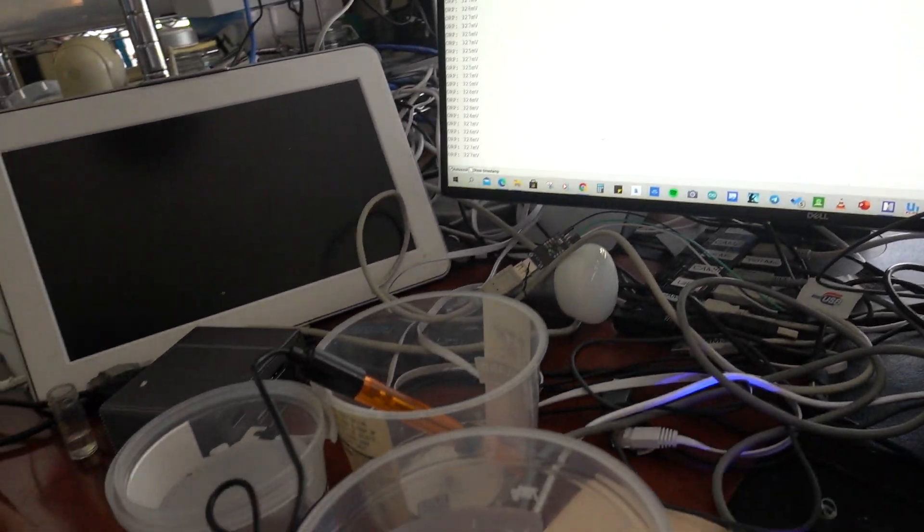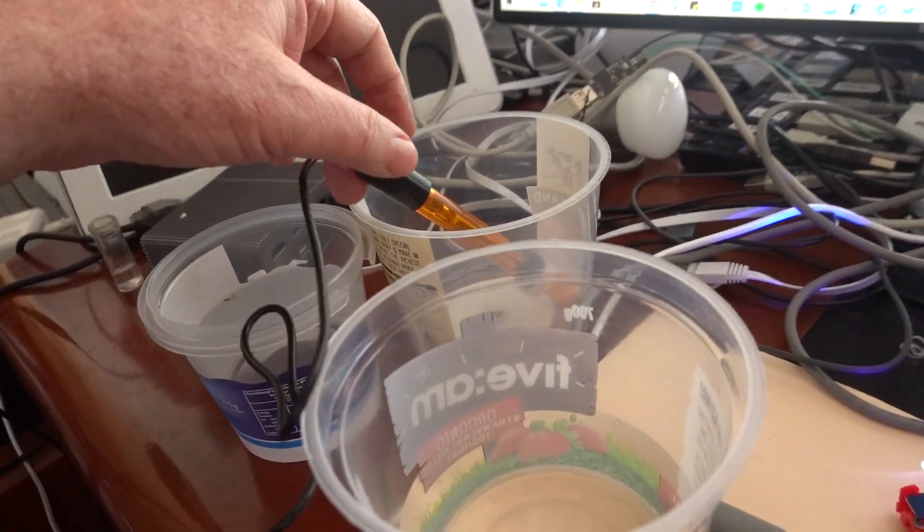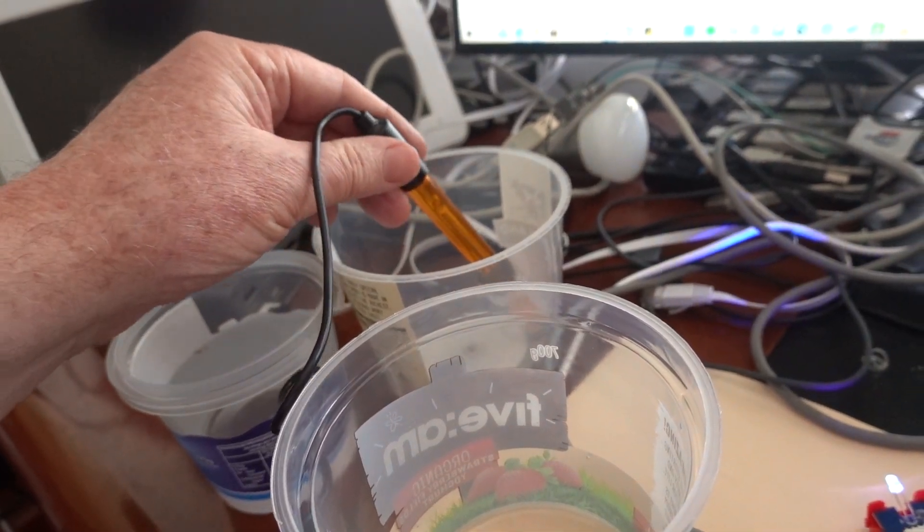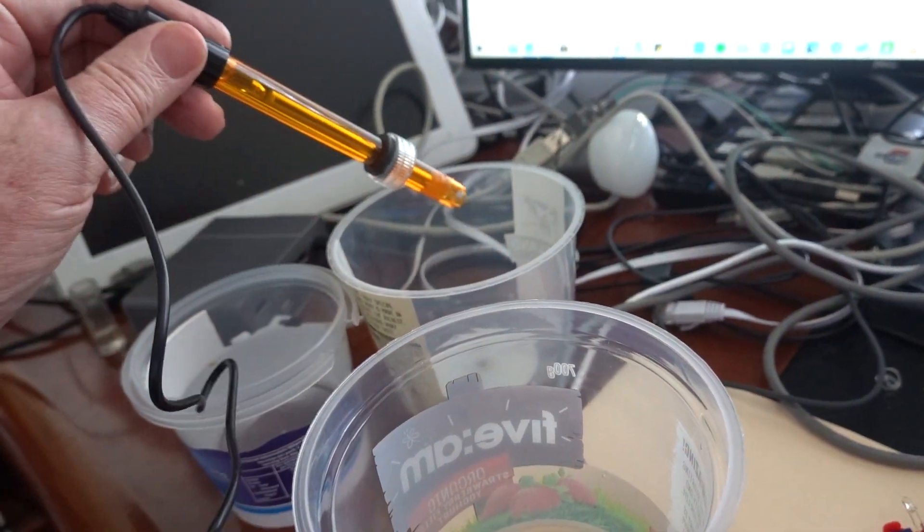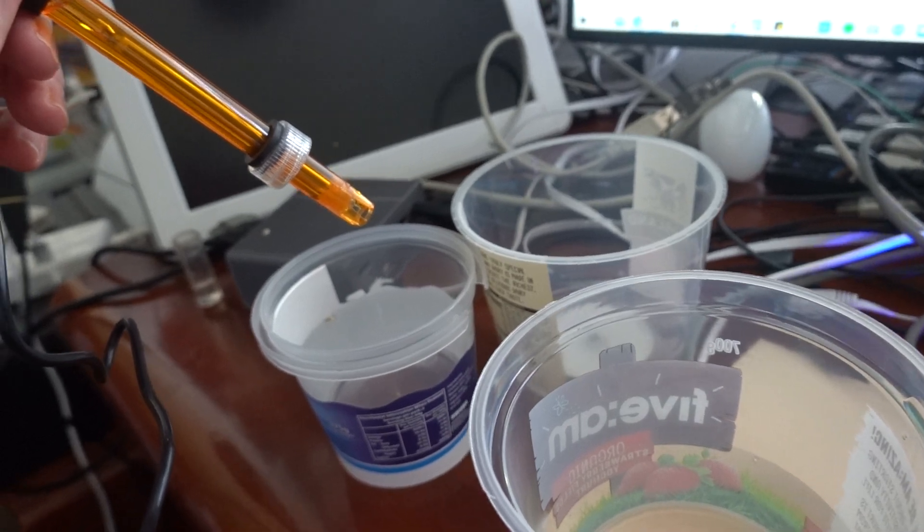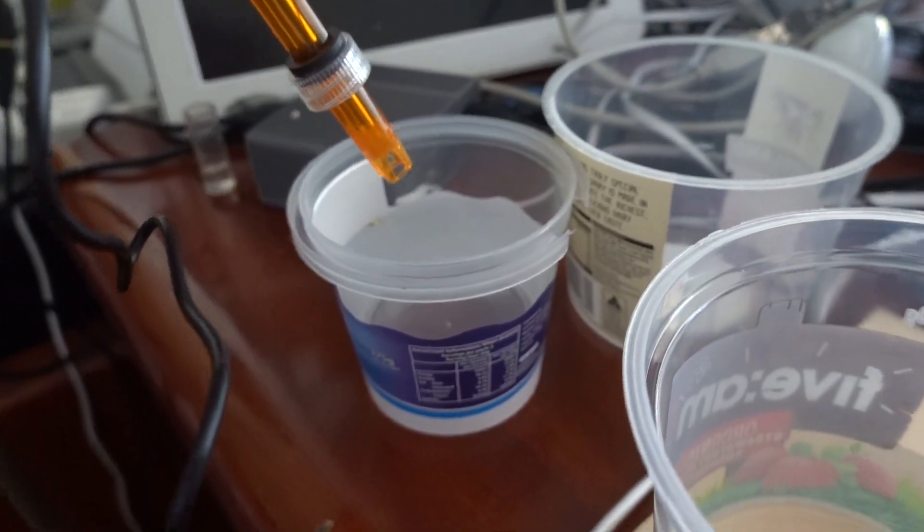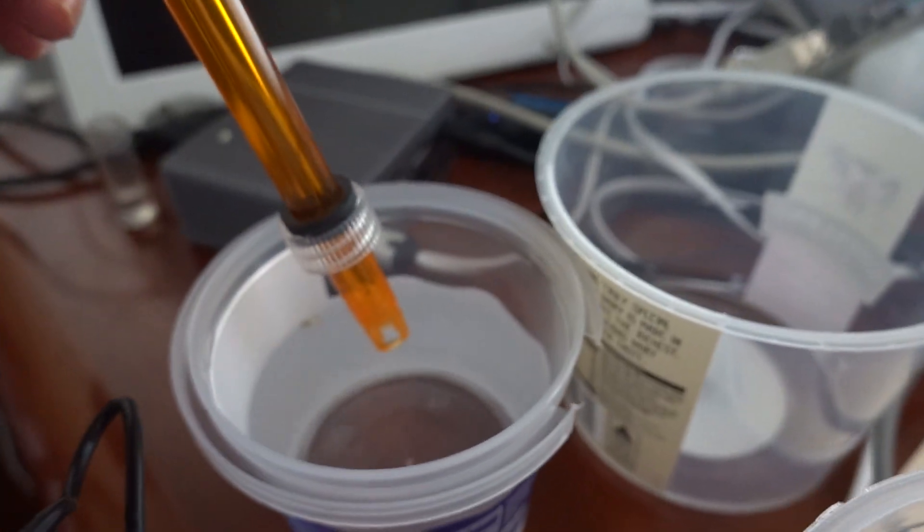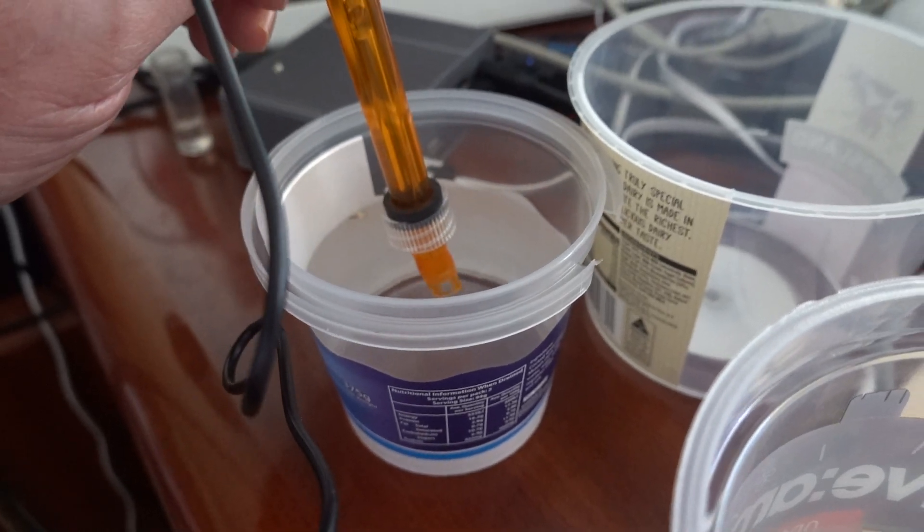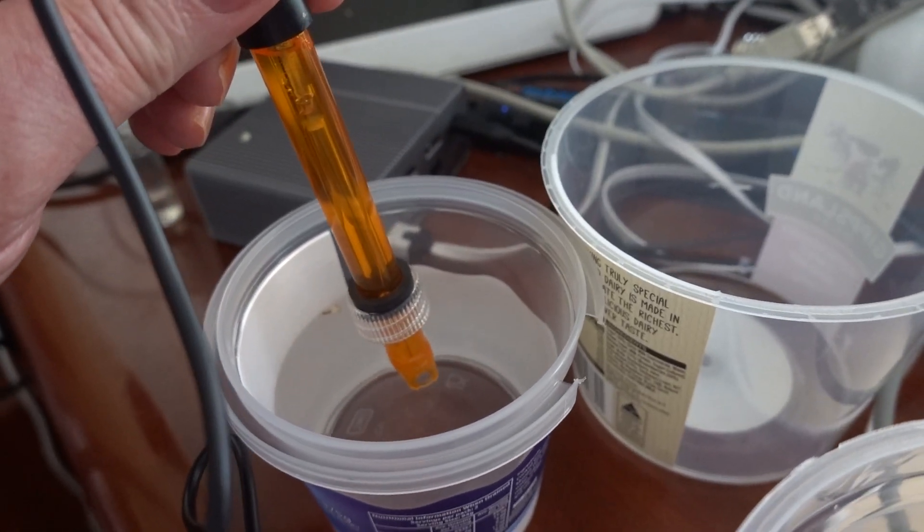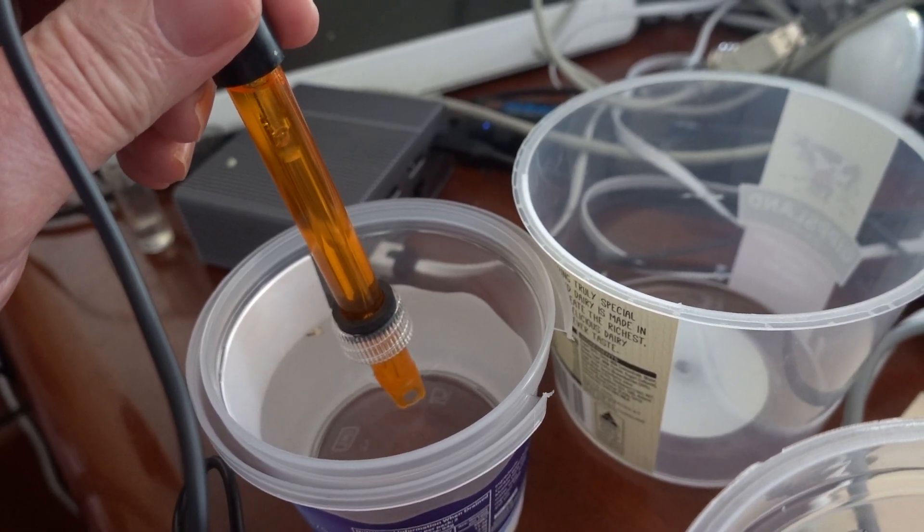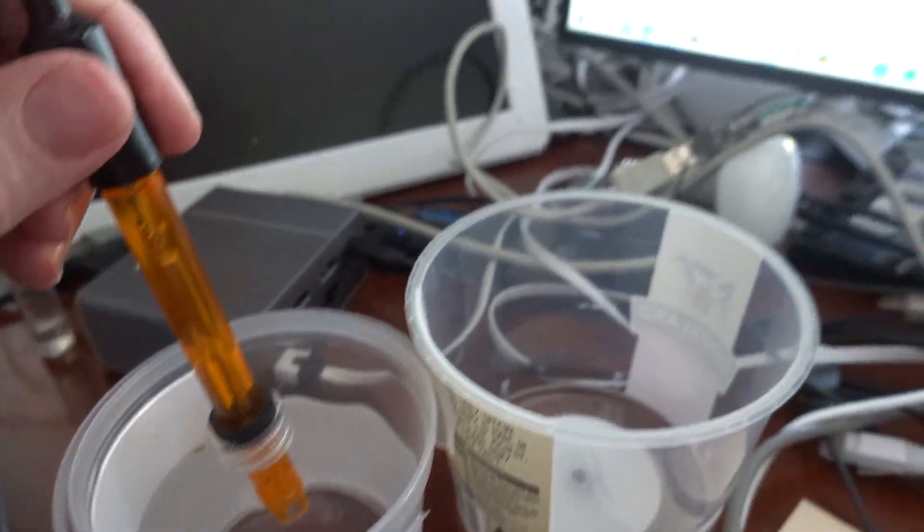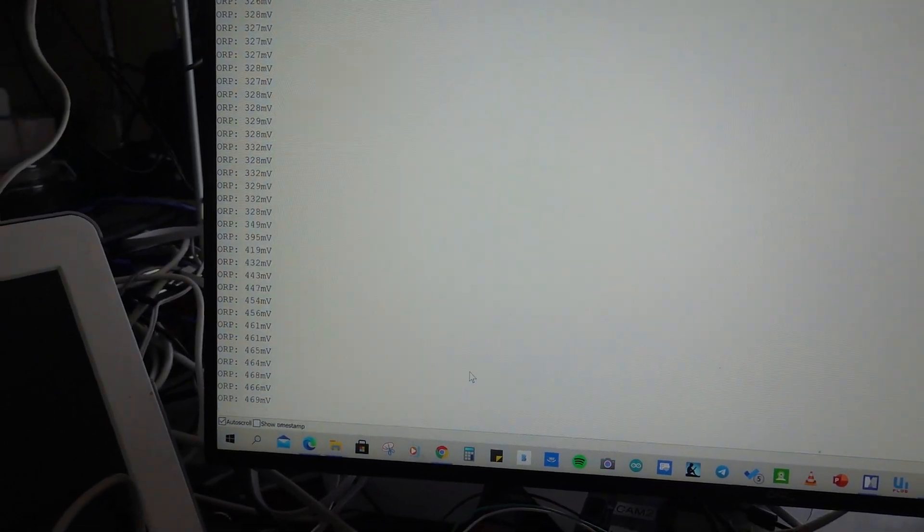Now what we're going to do is take the probe and put it into a sample of swimming pool water, which is just here. I'm going to dip it in to that level, and when I do that, you go back to the serial port reading and you can see we're getting higher values.